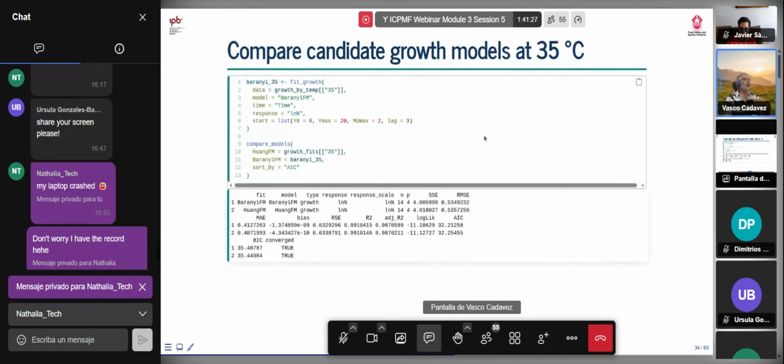Okay, so if you want to compare models, then we can also use the function compare models. This function belongs to the PredmicroR. So I need to fit a different model because previously I used the one model, but now I will fit the Barani model only to the 35 degrees GROW curve. For that, I use the function fit GROW. I subset the data by getting the temperature 35. I define the model, I define time, the response, the starting, and then you will get the results on this object on the Barani 35.